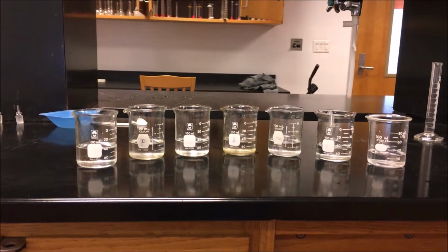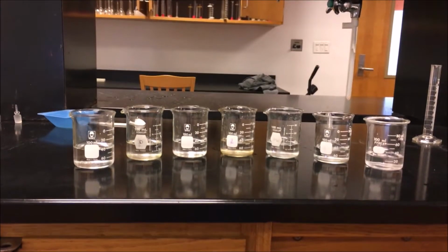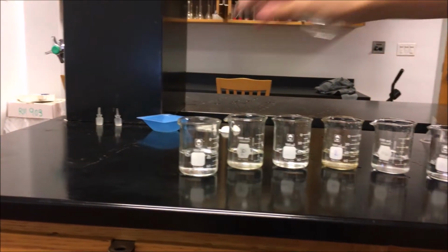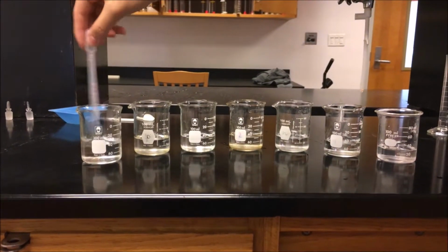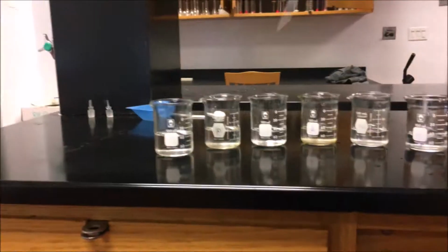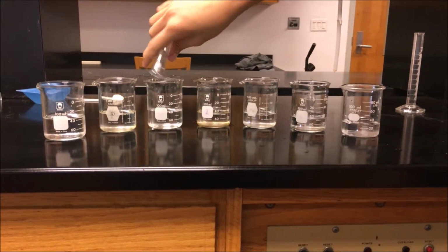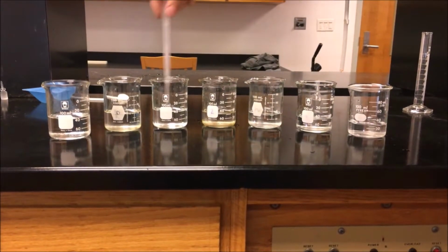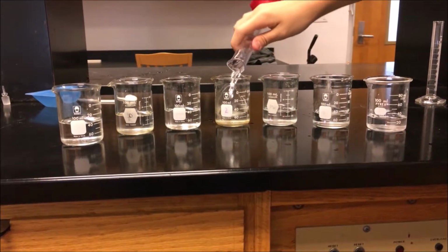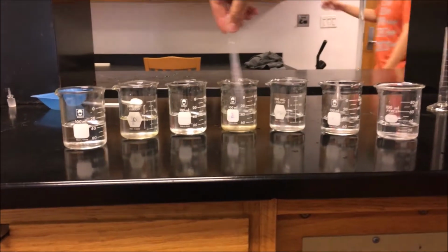Now, we have to add potassium iodide to figure out which beaker is the one closest to Ksp. Add 4 milliliters of KI to the first beaker, 6 milliliters of KI to the second beaker, 8 milliliters of KI to the third beaker. None of these form any precipitate. Add 10.5 milliliters to the fourth beaker, and you can tell it precipitates because it turns a little bit yellow.